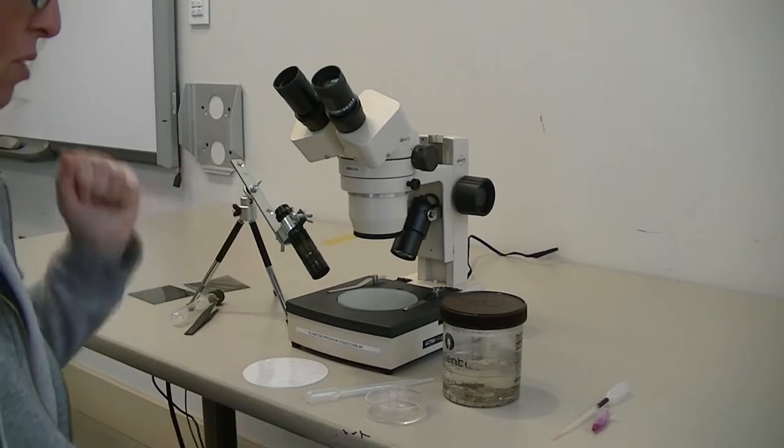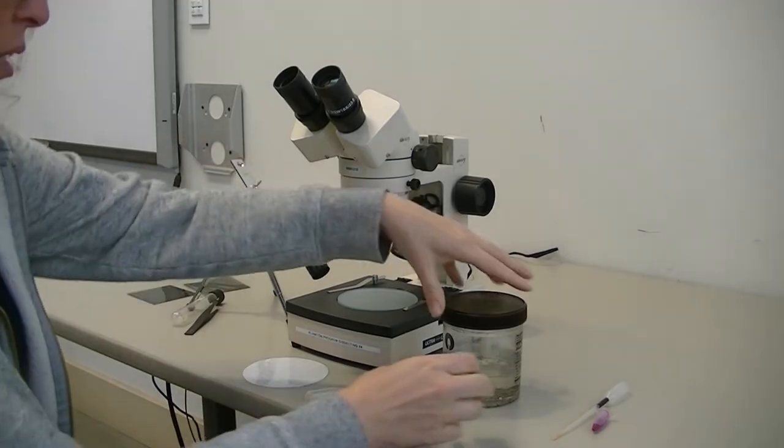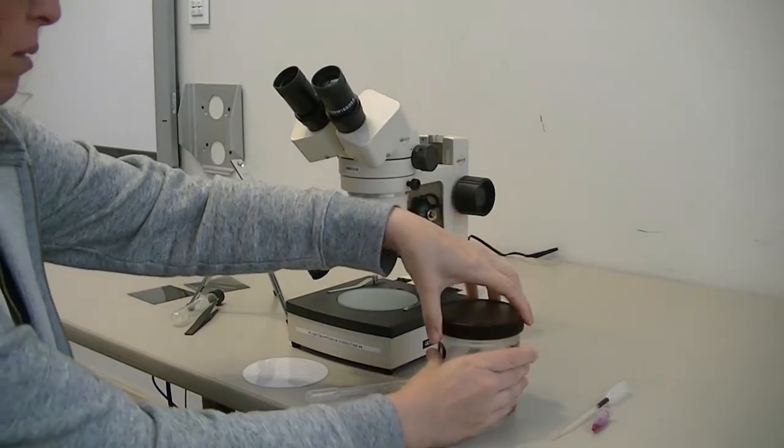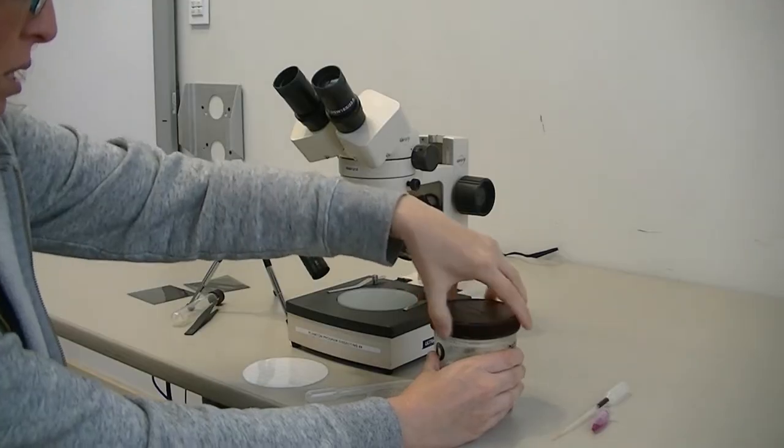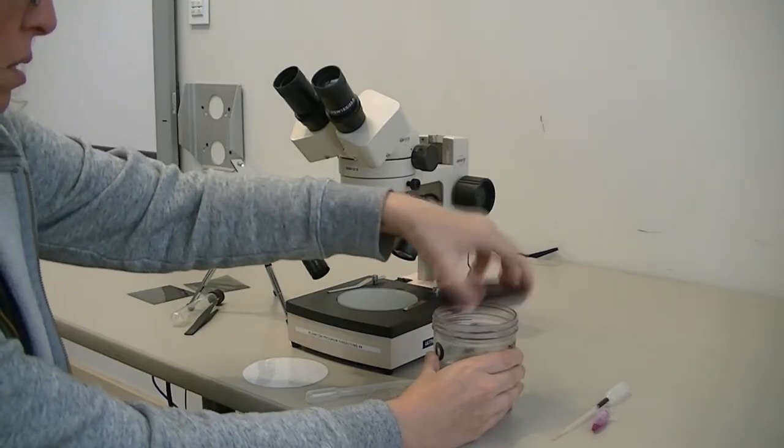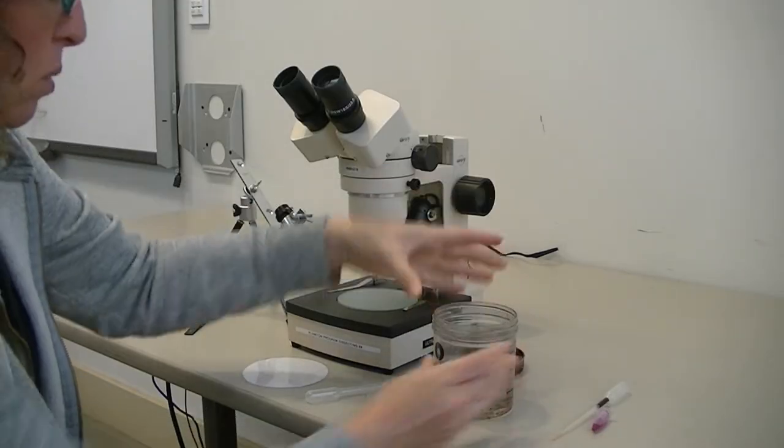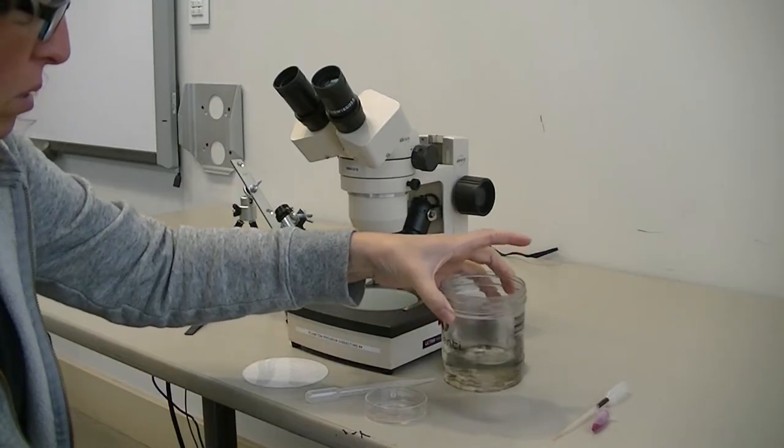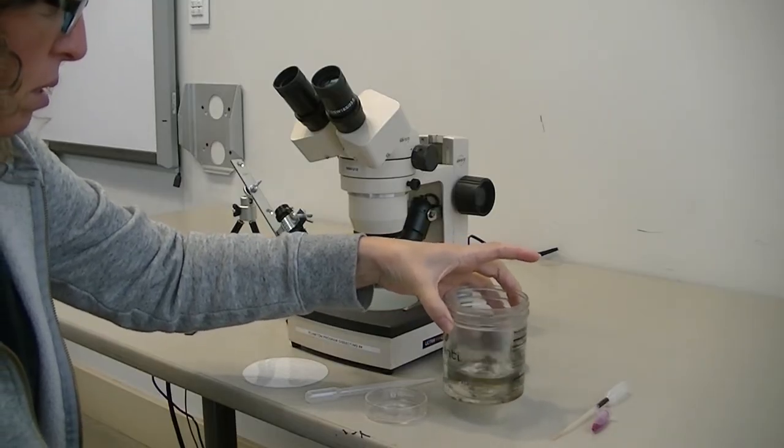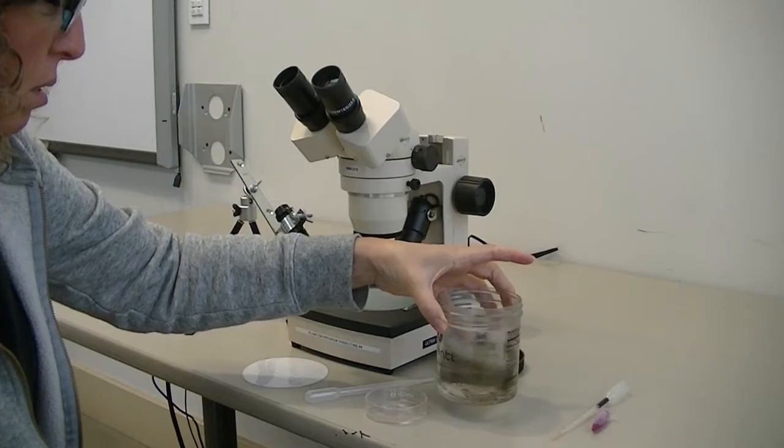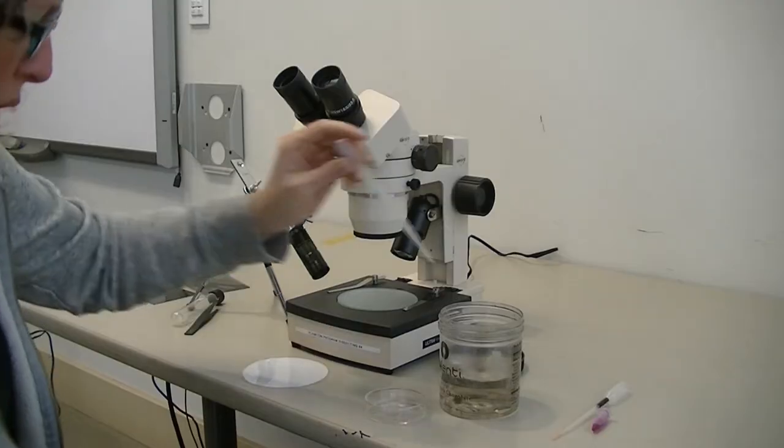The first step is to get your sample out of your jar, and you want to swirl it a little bit so that you get a good mix of plankton.